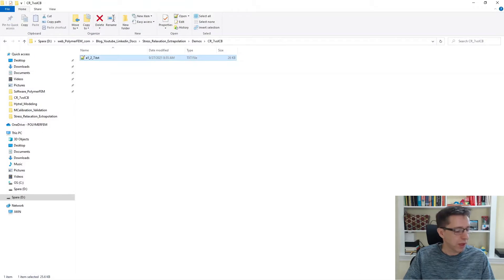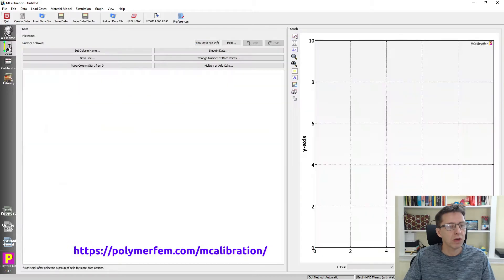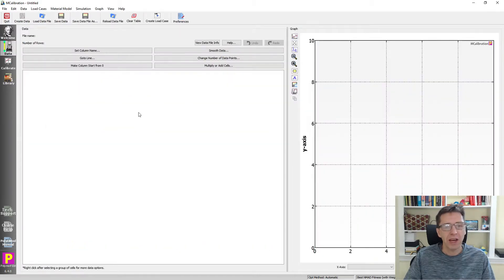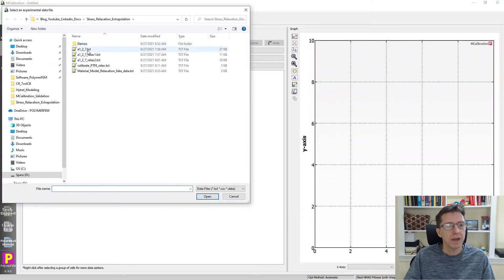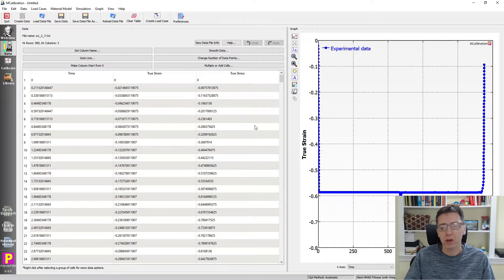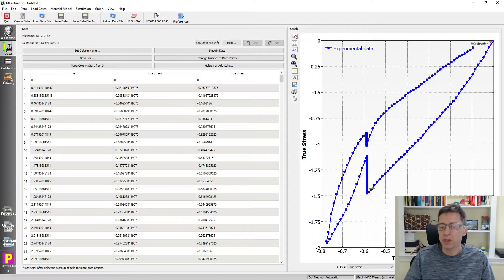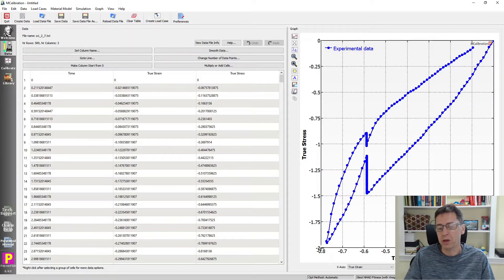I'm going to open this with MCalibration, which will help us better see what's going on with the data. I'll go to the data tab to read in the data. After loading the data file, we can see it has compression to about 50% strain or so, and then we held it for 10 minutes, then unload, continue to load, unload, hold, and so forth.